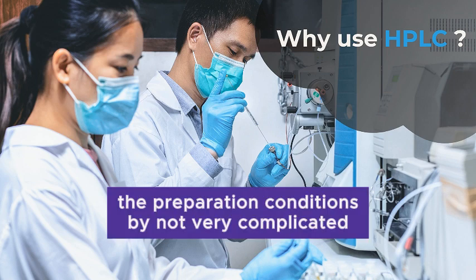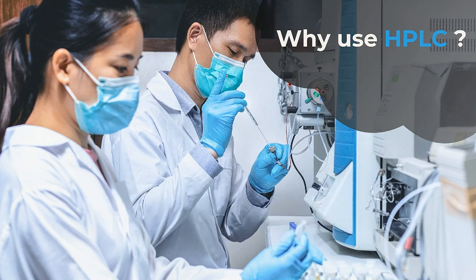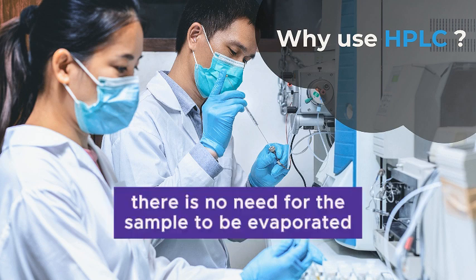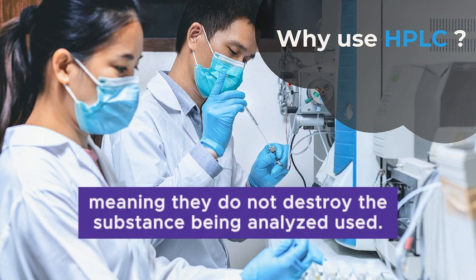The preparation conditions are not very complicated, meaning that, for example, unlike gas chromatography, GC, there is no need for the sample to be evaporated. Most of the detectors in HPLC are non-destructive, meaning they do not destroy the substance being analyzed.